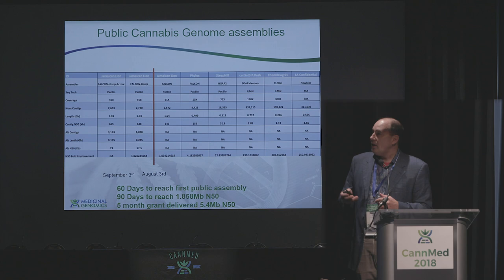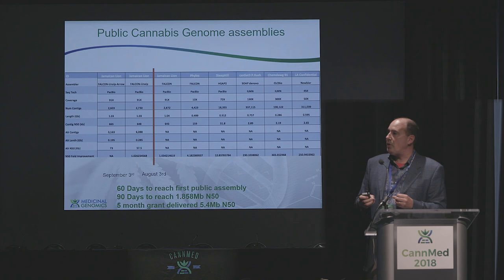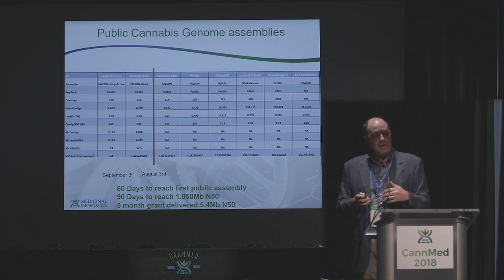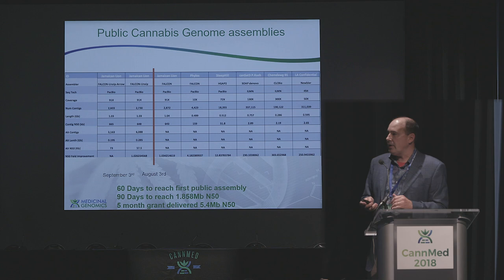So then we jumped on to Jamaican Lion and started pumping these numbers up into the 648 region and the 665 region with just the PacBio assembly alone. And then when we topped this off with version 6 chemistry, these numbers all jumped to 3.7 megabase N50 results. So we're really talking about thousands-fold improvement in contiguity from where we started in 2011 to what we have today. So very fast response working with cryptocurrency folks. They move very quickly, and it really helps to get the data out there publicly.